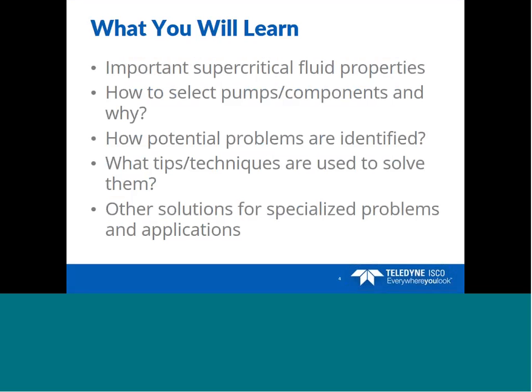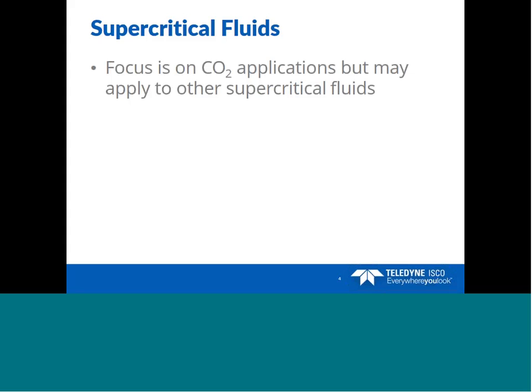Today you will learn important supercritical fluid properties, how to select pump components and why, how potential problems are identified, what tips and techniques are used to solve them, and other solutions for specialized problems and applications. This presentation will focus on CO2 applications that may apply to other supercritical fluids.